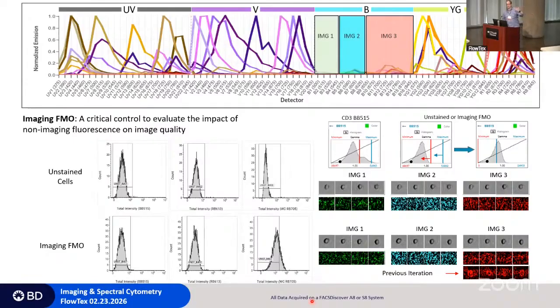And it's one of the big problems with this technology, that we don't have the ability at this point to compensate spectral dye spillover into imaging. So it's really a panel design issue. I've talked ad nauseam to the math guys, and they're like, yeah, every way they do it, the imaging information is there, but you have no way to do it on a pixel basis. You would have to do a uniform correction, and then it wouldn't be specific to the spatial distribution of your cell. So it's confounding. It's a critical part of combining these technologies to be able to troubleshoot your panel.